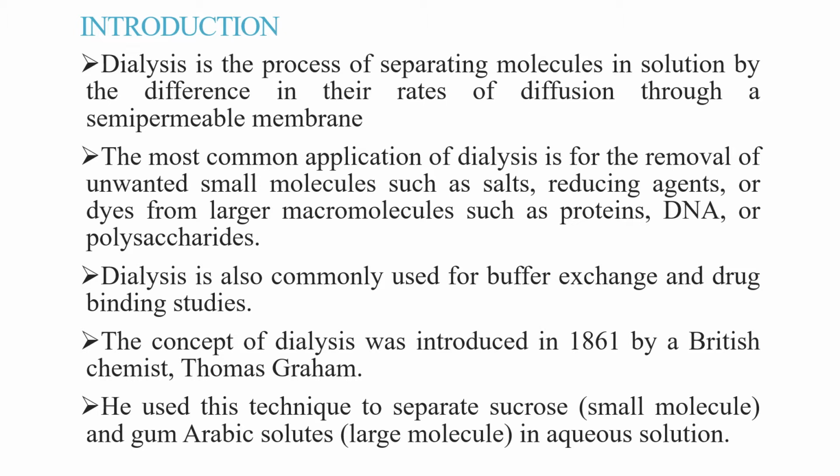So, dialysis is simply the process of separating molecules in a solution on the basis of the difference in their rate of diffusion through a semi-permeable membrane. Its most common application is the removal of unwanted small molecules from larger macromolecules like proteins, DNA or polysaccharides, and it is mainly used for buffer exchange and drug binding studies. This concept was introduced in 1861 by the British chemist Thomas Graham, who used this technique to separate sucrose, a small molecule, and gum arabic, a large molecule, in aqueous solution.